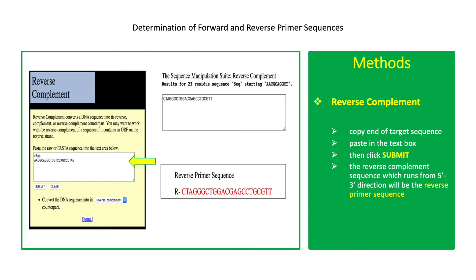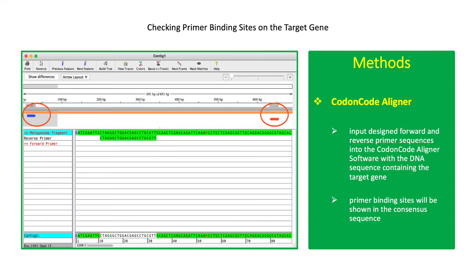Copy the end of the target sequence, paste it in the text box, then click Submit. The reverse complement sequence, which runs from 5' to 3' direction, will be the reverse primer sequence. After generating the forward and reverse primer sequences, check the primer consensus sequence with the target gene. Codon-Code Aligner can be used to visualize the primer binding sites on the target gene. Input the designed forward and reverse primer sequences into Codon-Code Aligner with the sequence of the target gene. Primer binding sites will be shown in the consensus sequence.